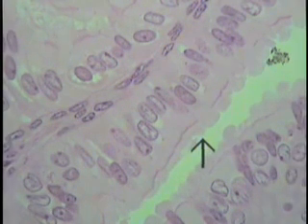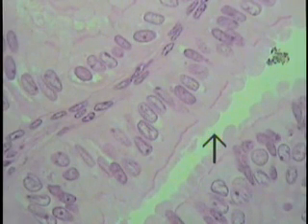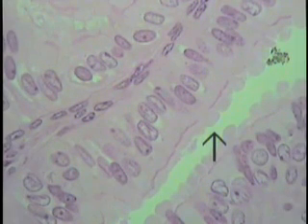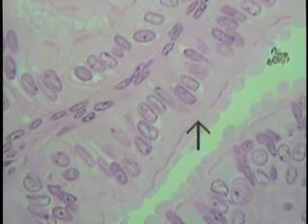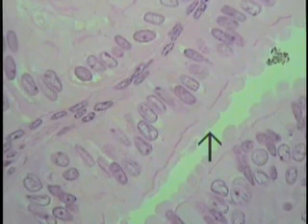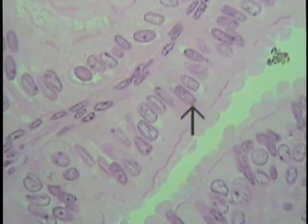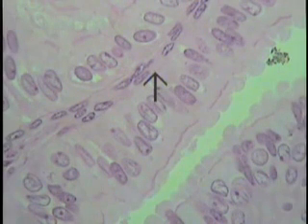Also within this lining epithelium are simple columnar cells modified for secretion that do not show cilia or the basal bodies. One is located here, and you can see how the cytoplasm has extended or ballooned out into the lumen of the oviduct. So its apical extent would be here, the nucleus located here, and its base would be on the basement, resting on the basement membrane at this location.